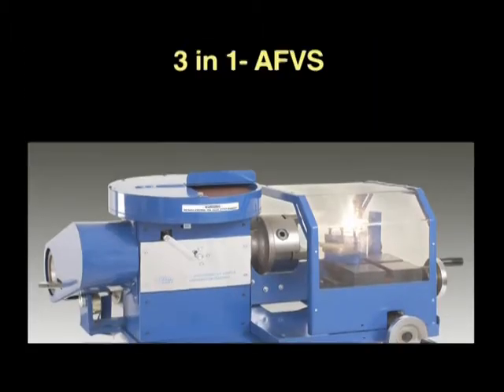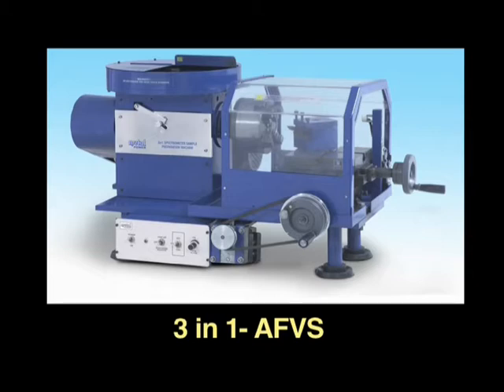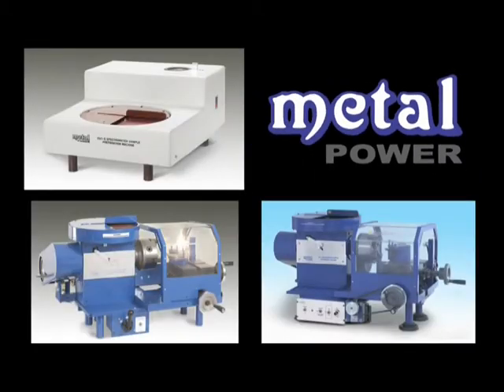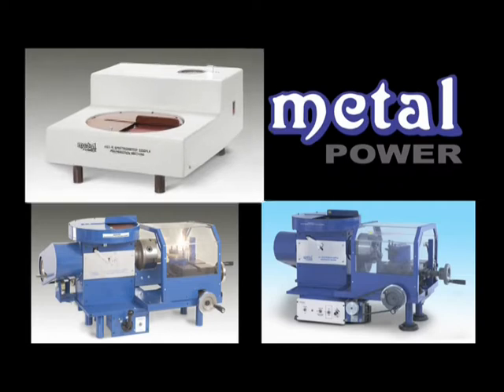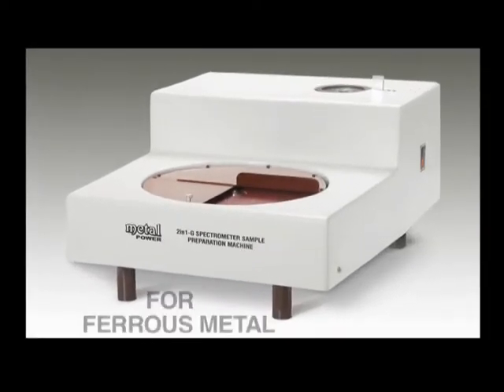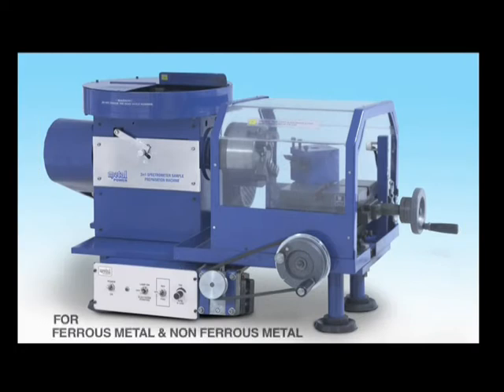3-in-1 and 3-in-1 AFVS as per customer requirements and applications. The 2-in-1 G is a ferrous metal-specific machine, whereas the 3-in-1 series are versatile and work for both ferrous and non-ferrous metals.